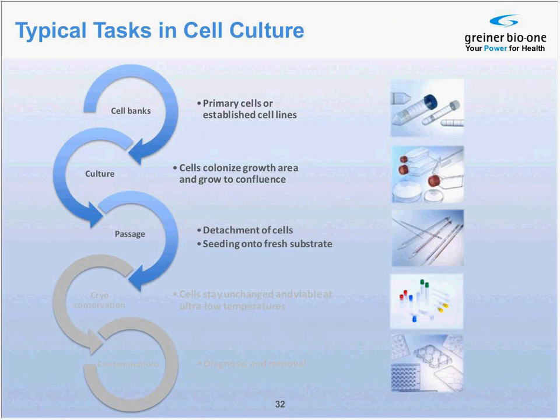Subculturing of suspended cells is fairly easy and can be done by aliquoting the required cell number to fresh medium. Alternatively, cells can be spun to the bottom of a tube. The spent medium then can be removed or replaced by fresh medium. Adherent cells, on the other hand, can be subcultured either by shaking or scraping of the cells with a rubber policeman or by applying an enzyme. Shaking of the cells is a very gentle method, but it can only be applied to loosely adherent cells.